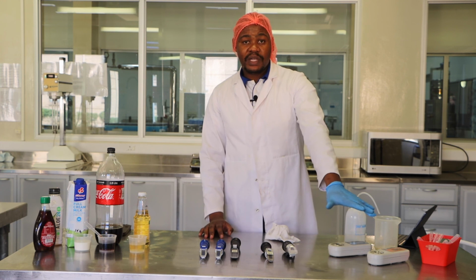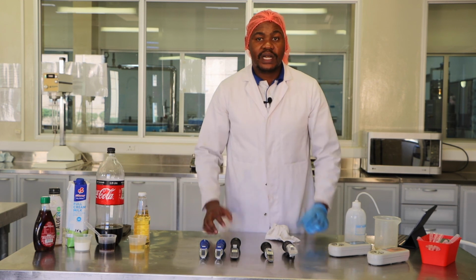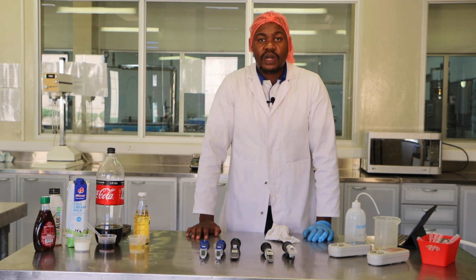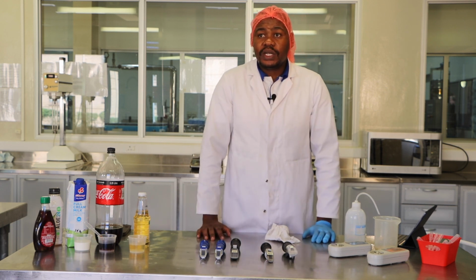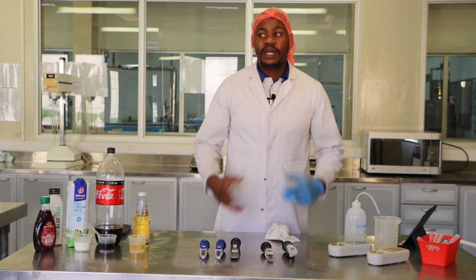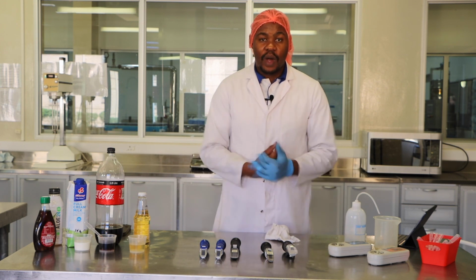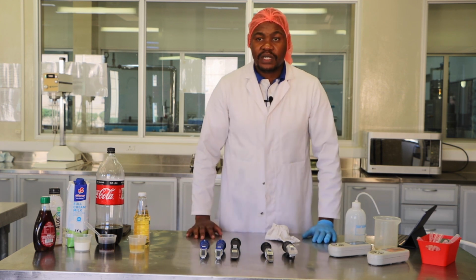A digital refractometer can also be used for products such as yogurt and mayonnaise, products that are semi-liquid, and you can also use them for liquid material, right? So the refractometer is a very important tool that we use in food analysis to determine the concentration of sugar and salt in solutions. Of course, in your practical, you must use the Pearson square to determine the sugar concentration, and then use the refractometer to verify that.